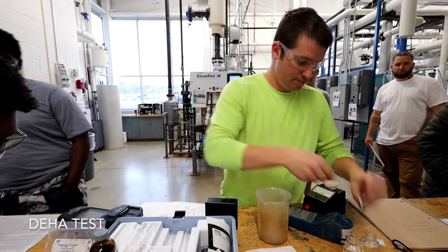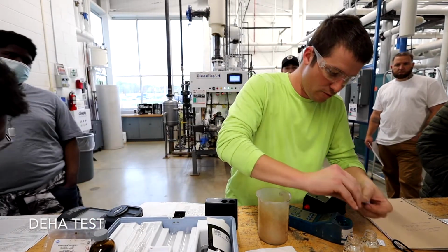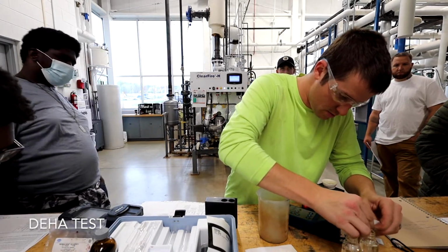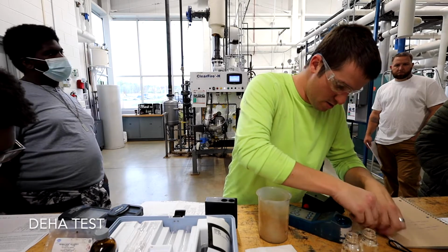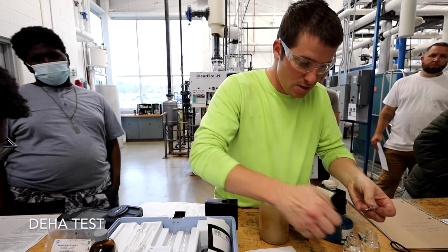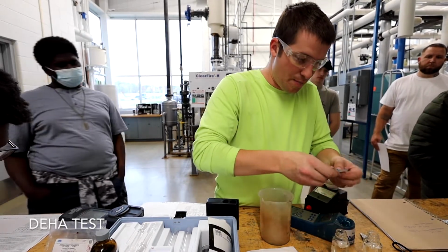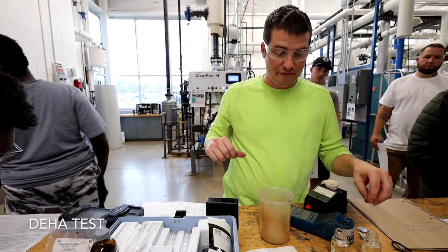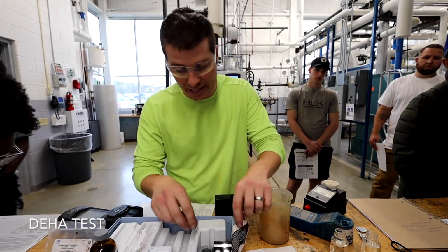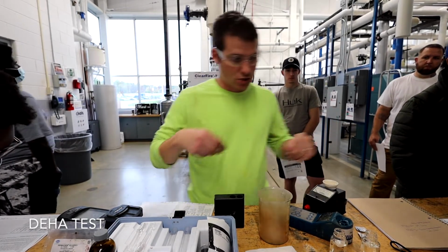All right. So they should tear pretty easily for you. And then you just want to go ahead and add 1 there and add 1 here. Yeah, so we're in the high range. Yep, high range, because again, we're gonna want like 300 to 500. And again, this thing only reads to 80. So the only way you're gonna get there is by diluting. All right, so now that you did that, swirl the mix.